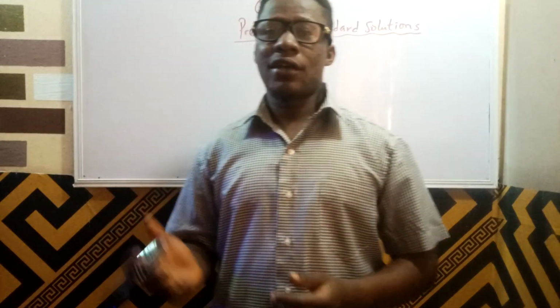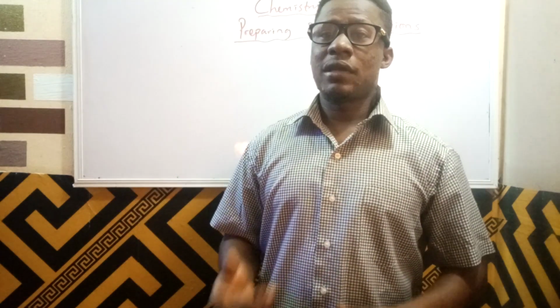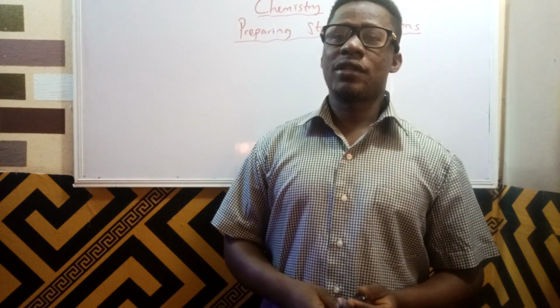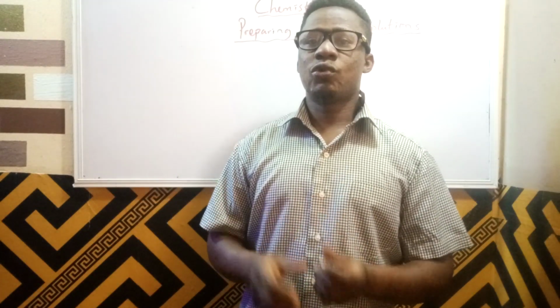Now, it is important that as a student, you also learn how to prepare standard solution such that you could perform the whole experiment yourself without the assistance of the teachers, or even at the higher institution, it is expected that you know it when you are doing your project. So learning how to prepare standard solution is quite important for all chemistry students. Now, what is standard solution? Standard solutions are solutions of known concentration.